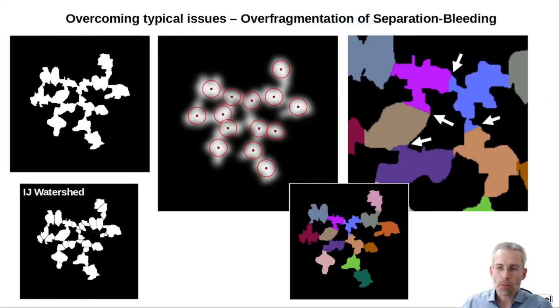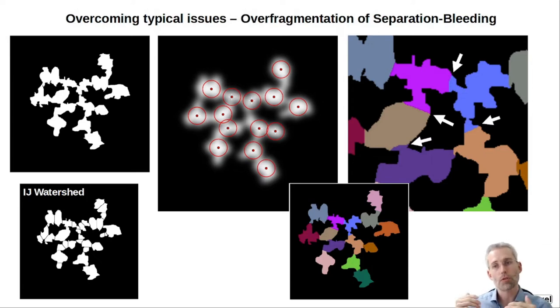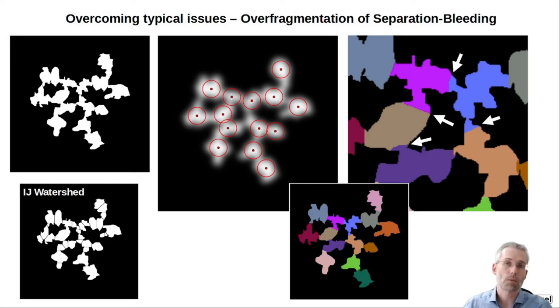The typical problem we see in watershed separations is that especially for irregular shaped objects we get typical over-fragmentations. That can be partially avoided with this and other tools based on seeds, like maxima used as seeds. However, they might also have some disadvantages: if you have objects of different sizes, the distance from the seed to the outside of the object varies depending on the object, which can quickly lead to bleeding into the neighboring object and incorrect separation positions.